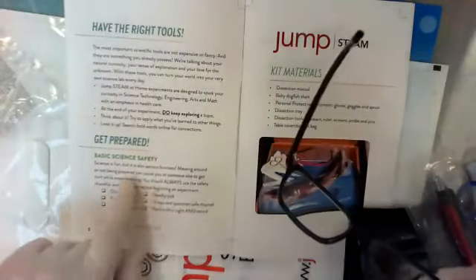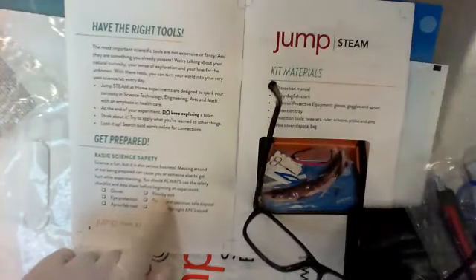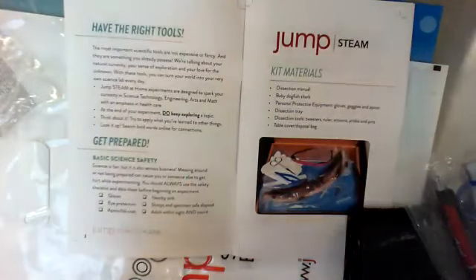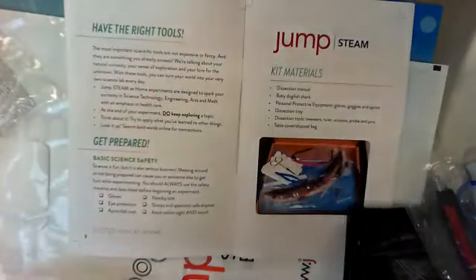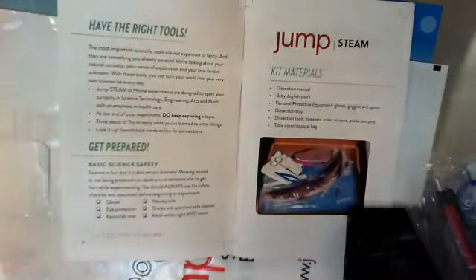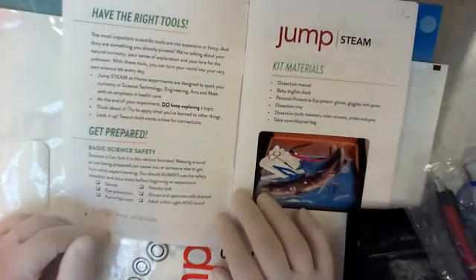If you get a little bit of something that splashes in your face, just go to the sink. So it says right here, nearby sink, and just tilt your head sideways, just like this, underneath the sink, and let it run through and over your eye so that you get it all off. I don't know if you saw that, but just tilt your head sideways and let it run. They say 5 to 10 minutes. Let it run till you're comfortable. I've never had formalin in my eye. I don't know if it's stinging or not. It's kind of oily, so I would imagine it just feels gross. But you have to let it run by.